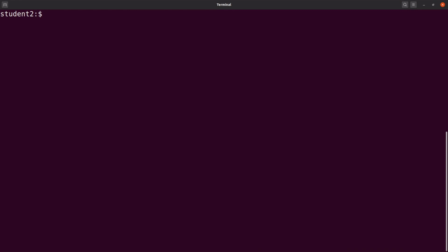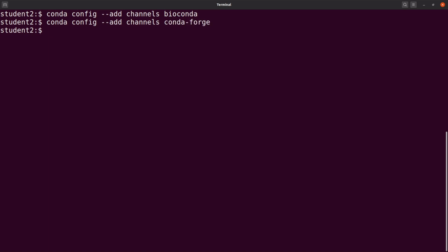Okay, so before you install, you need to make sure you have added Conda channels. We will add 2 channels here. So let's add them. We say conda config --add channels, and the first channel is bioconda. Let's add a second channel. So we say conda config --add channels again, and the second one is conda-forge.